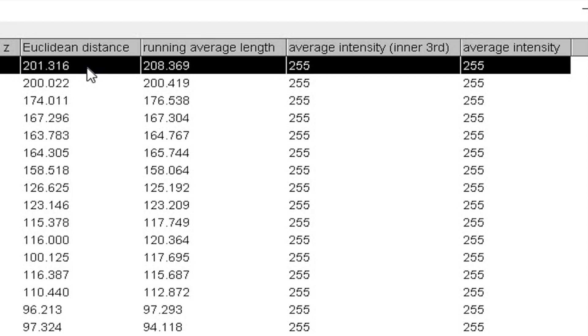In the next column, it also shows the Euclidean distance between those extreme points. This value has proven to be a good indicator of the tortuosity of the 3D object.